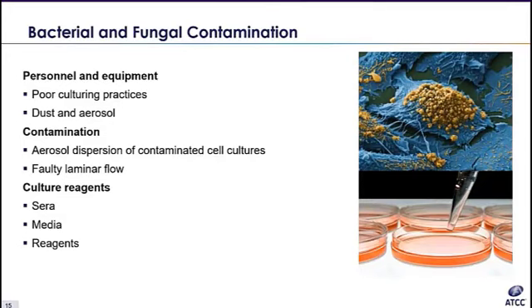Improperly maintained equipment can fail to protect against the entry of contaminants. Overpacking autoclaves or ovens can even cause problems with uneven heating, creating pockets of non-sterile supplies. The flow rate of hoods, if not properly adjusted, can allow particulates to enter.